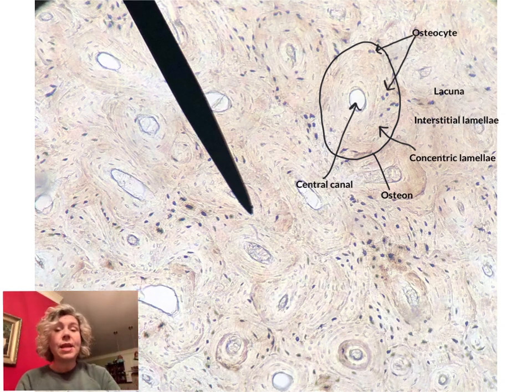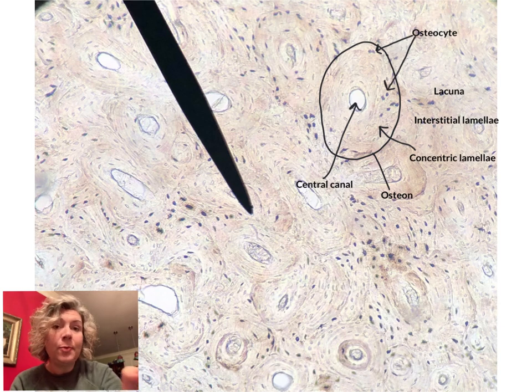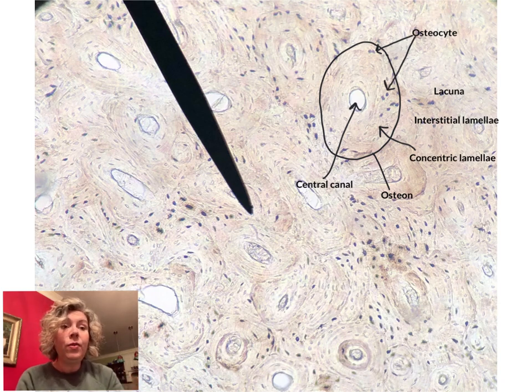Okay? Now, as those osteoblasts are building the matrix and working toward becoming trapped and becoming an osteocyte, they reside within these little clear pockets, these little spaces. Those clear pockets where they live are known as lacunae. And you can see in this picture that there's some empty lacunae there because when this slide was made, some of these bone cells died. And so the lacunae are actually empty. They're clear on the inside.